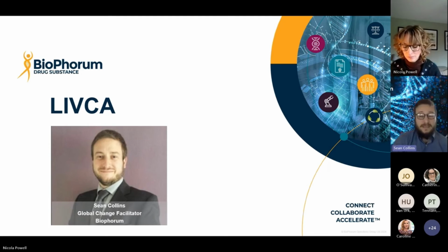LIVCA is essentially the same situation. It's something everyone has to do. It's obviously something very important, but the guidance that exists out there is quite limited. And so the thought was, could we do something similar with LIVCA? Could we identify a best practice guide on how to perform LIVCA studies to try and streamline and minimize that?